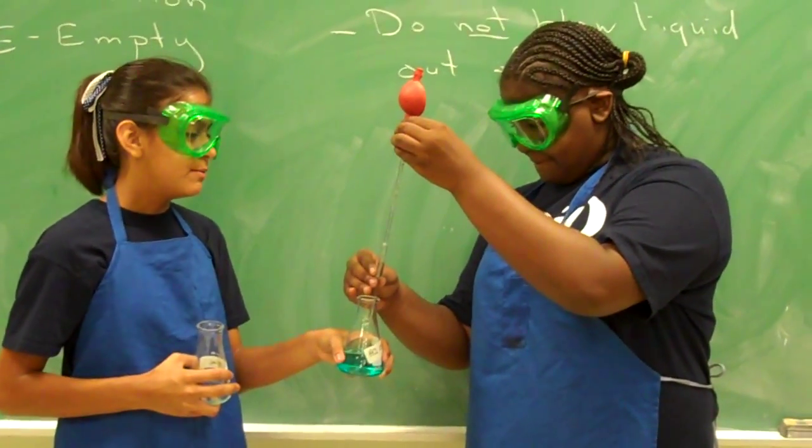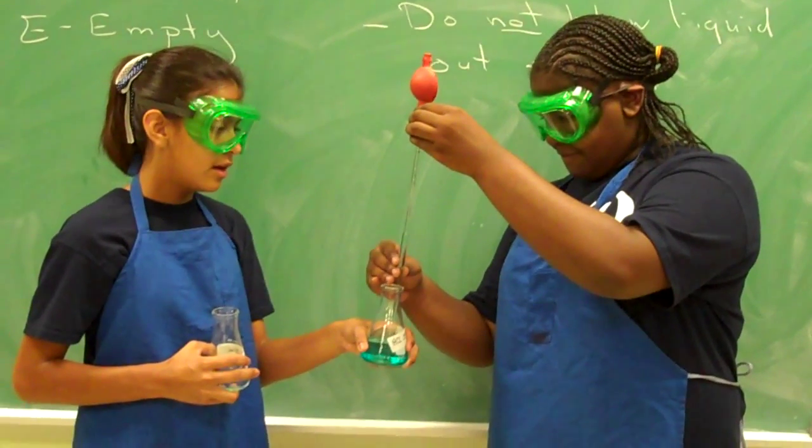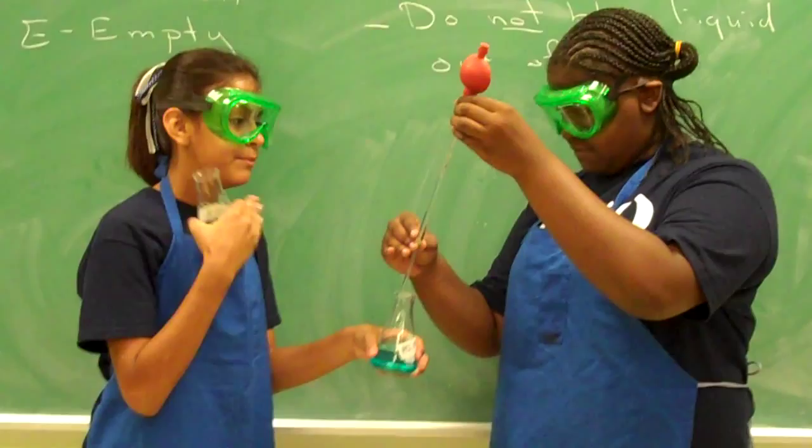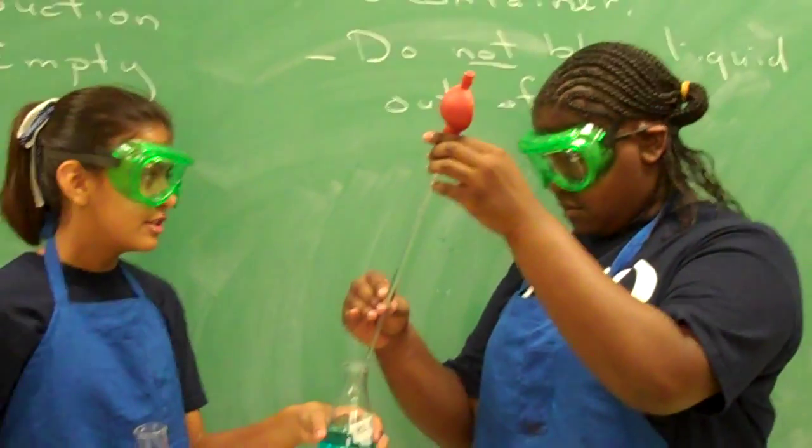Hold the pipette straight up so it'll work better. As you can see, there is a brown line right there that indicates that it's 5 milliliters exactly.